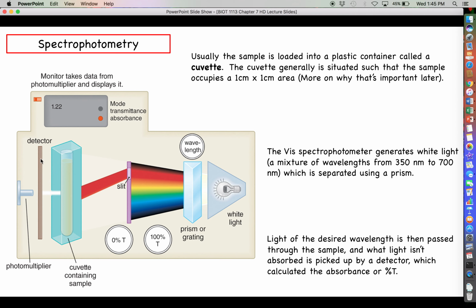The one that I mention here is that, unfortunately, this is only going to work for molecules whose concentration can be expressed with molarity. So that's probably going a little bit too far, but practically speaking, you wouldn't really want to use this unless you can actually measure something in terms of moles per liter, which is what molarity is.